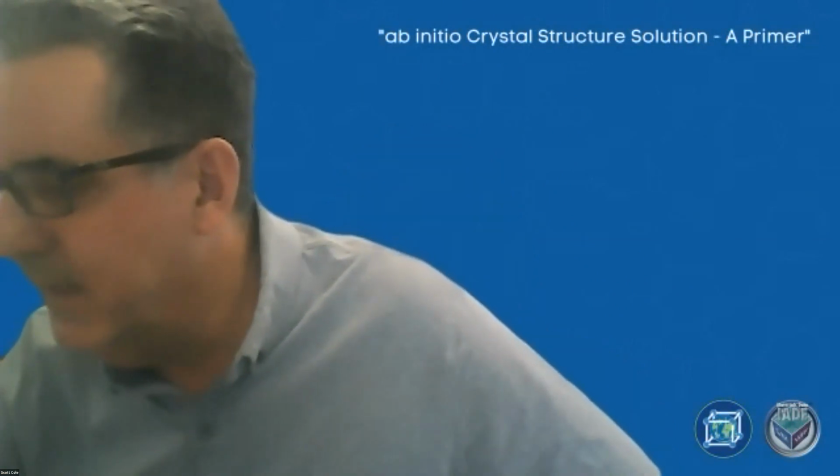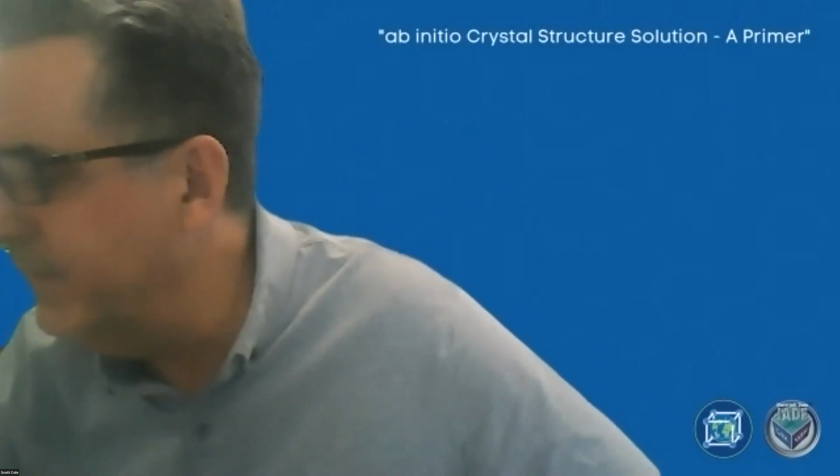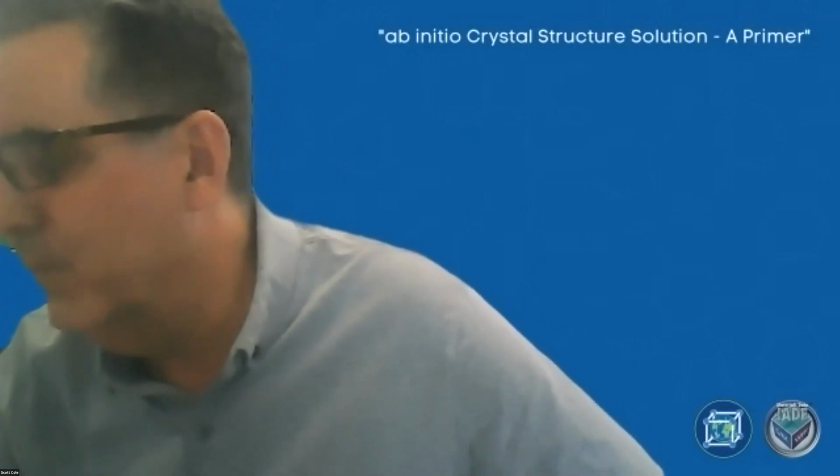First one is, can I use an ICDD PDF database to get started with isostructural analysis to help with indexing? And once I have that information, can I use Jade for additional analysis? Okay, well, I can be flippant and say yes, yes, yes, and yes. Now let's give the real answer.